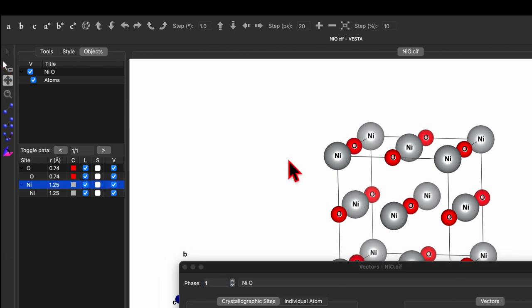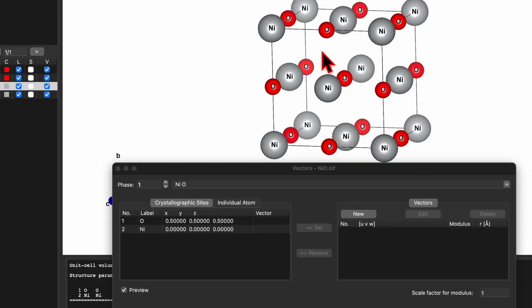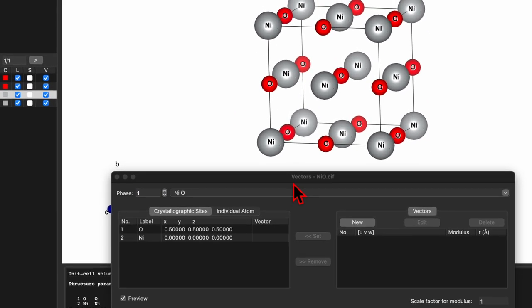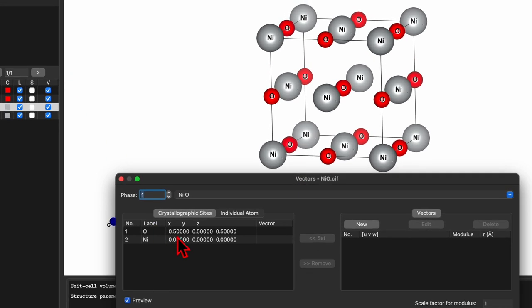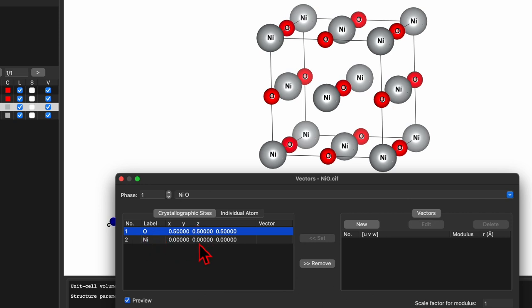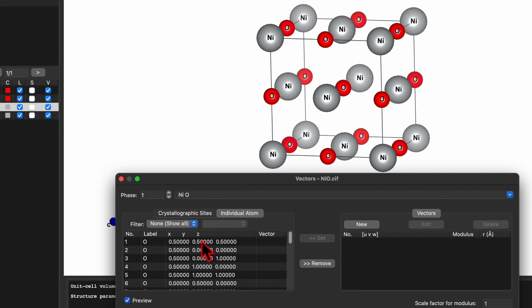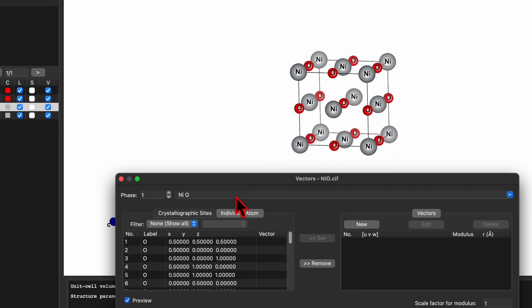Move the window up a little. In this new window, on the left-hand side you will see numbers 1 and 2, labeled oxygen and nickel, with Cartesian coordinates of 0.5 and 0. This is phase one with nickel oxide — this is the crystallographic site. If you go to individual atoms, you will see the list of atoms.